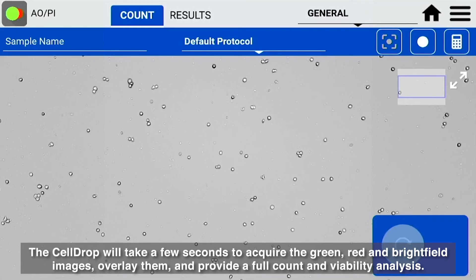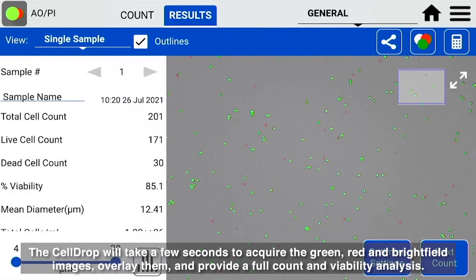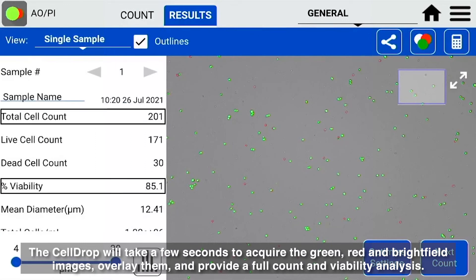The CellDrop will take a few seconds to acquire the green, red, and brightfield images, overlay them, and provide a full count and viability analysis.